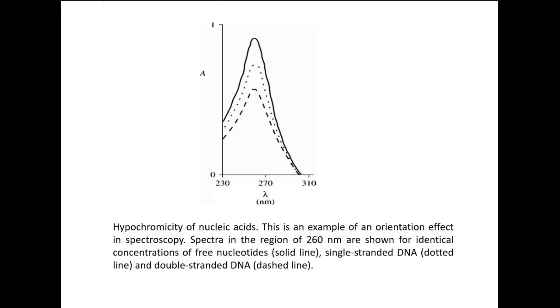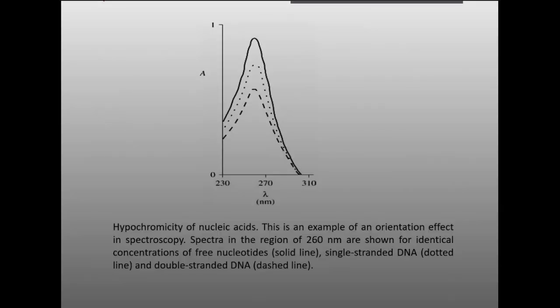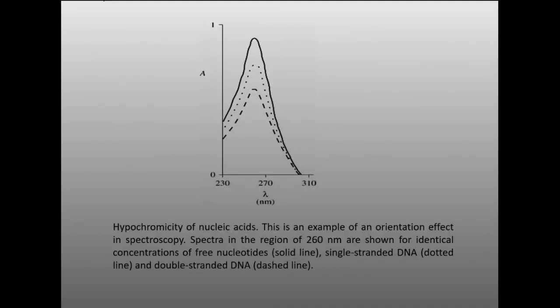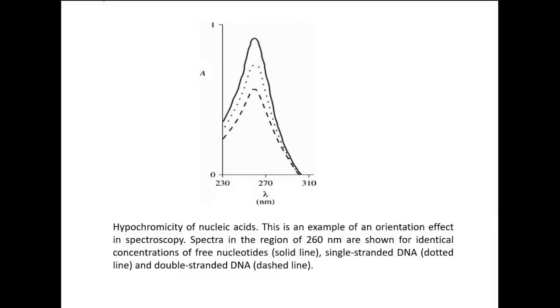During denaturation, what happens? If the DNA is intact, the level of absorbance of UV light is very, very low. When it undergoes denaturation, when the strands are getting separated, more adenine residues or bases are exposed to UV light, which increases the absorbance. During renaturation, because of the complementarity, not many bases are exposed to UV light, so absorbance keeps getting reduced. So the hyperchromicity or hypochromicity, simply speaking the denaturation or renaturation kinetics of nucleic acids, can be studied by using the simple procedure of UV visible absorption spectroscopy.